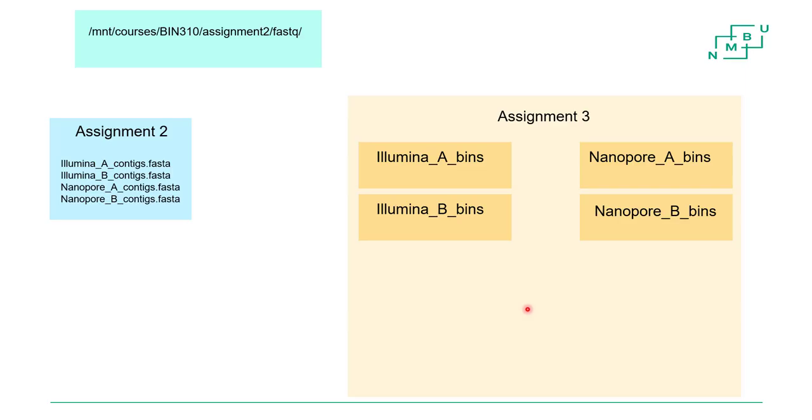It's important that we always do it like this when we have contigs from different samples. We should treat them separately for some time, especially this coverage information, right?